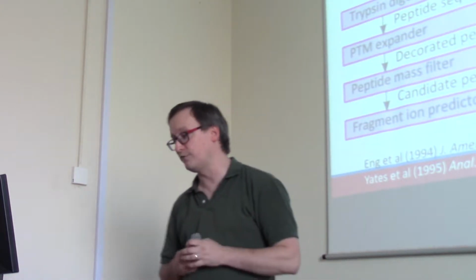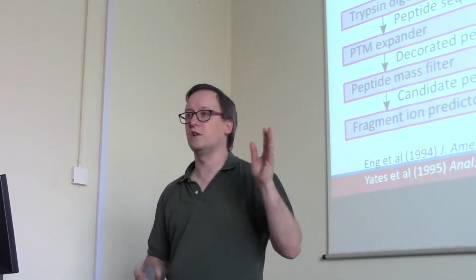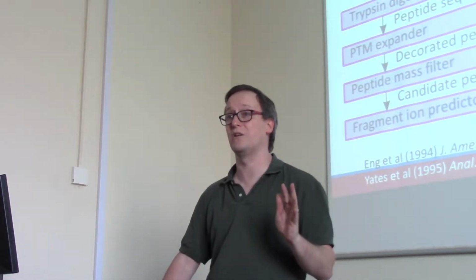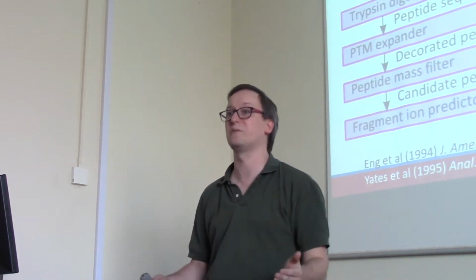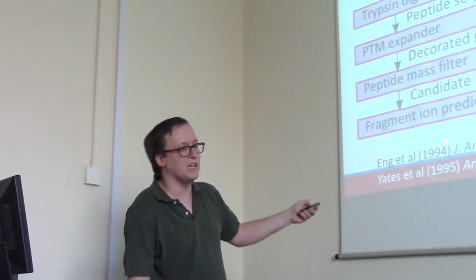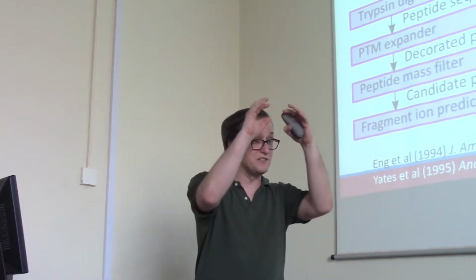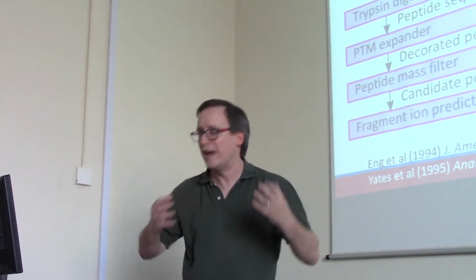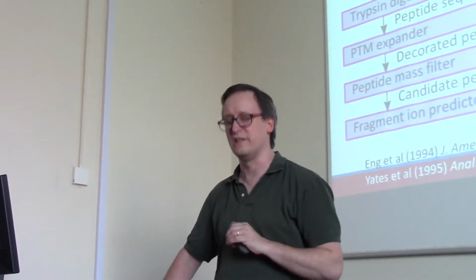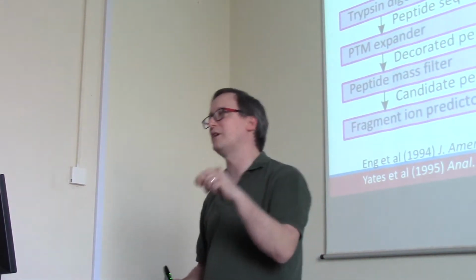Database search engines were first introduced by the Yates lab in 1994. Disclosure here, John Yates was my PhD advisor. I had no idea what I was getting into when I stepped into his laboratory, but 2 years earlier, he had just published the most momentous paper in proteomics history. My opinion, it's great. You don't have to repeat that. So, we see that 1994 was this benchmark year. Our ability to transform piles of tandem mass spectra into piles of sequences became a real deal. How did we do that? I already said, trying to just read sequences off of the spectra hurts. It's a really painful, awful experience, and you sit there adding amino acids and subtracting amino acids and looking for water losses.